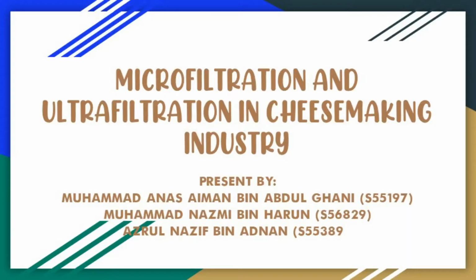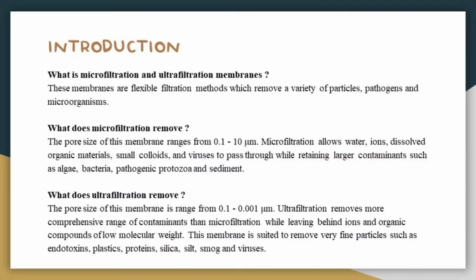We'll present about microfiltration and ultrafiltration in the cheesemaking industry. First of all, we go for the introduction. What are microfiltration and ultrafiltration membranes?